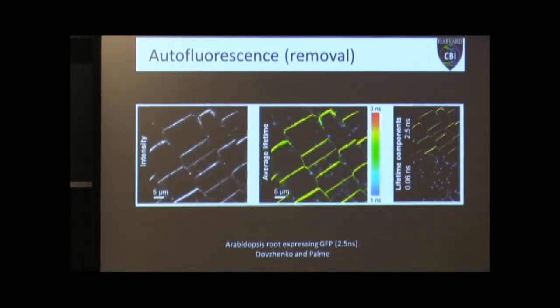So that's all I'm going to say about FRET. I'm just going to quickly show you a couple slides about some other applications of FLIM-FRET just to finish up. So I mentioned to you earlier that you can do autofluorescence removal with FLIM-FRET.